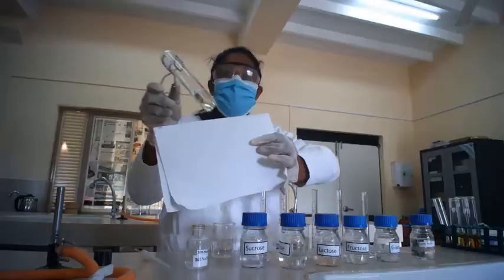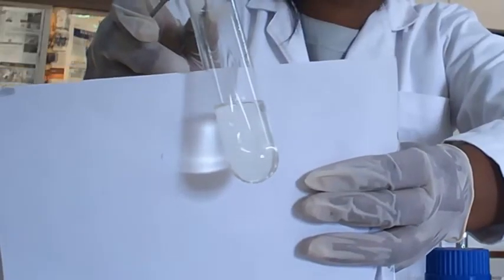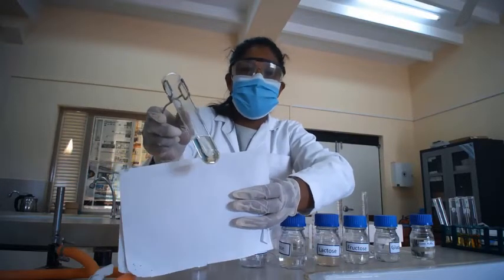You can see the color of the sucrose solution has not changed. It was already colorless and now also it is colorless.